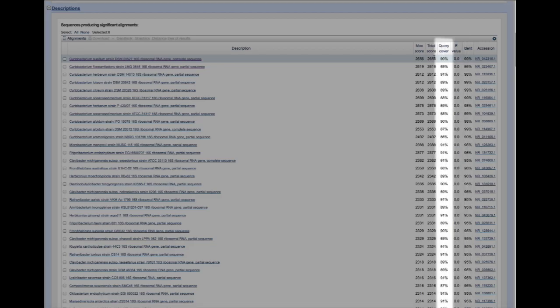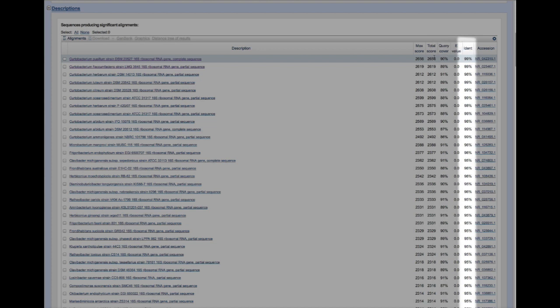The query coverage tells us how much of the sequence is actually analyzed in the match — it is 90%, so the values you're seeing do not include the regions at the very ends of the sequence. The identities column tells us what proportion of the nucleotides in our query — the sequence we put in — and the subject — the match we pulled out — are identical. It's 99%. Does this mean that we can conclude the strain is Curtobacterium pusillum?